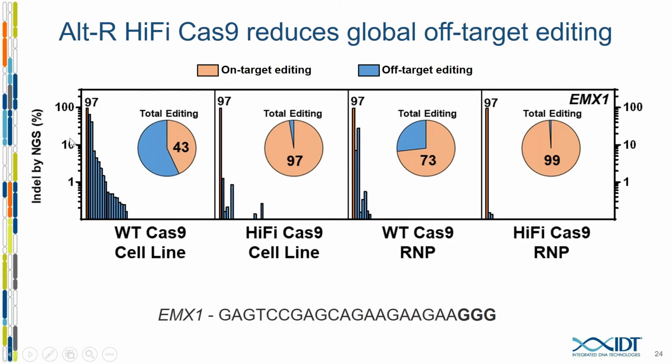And in the log-based graph here, you're showing in this orange color the on-target editing. The far left is the on-target site. You can see that's quite high for this guide. And then all the blue sites are evidence of off-target editing at different frequencies, all rank ordered.